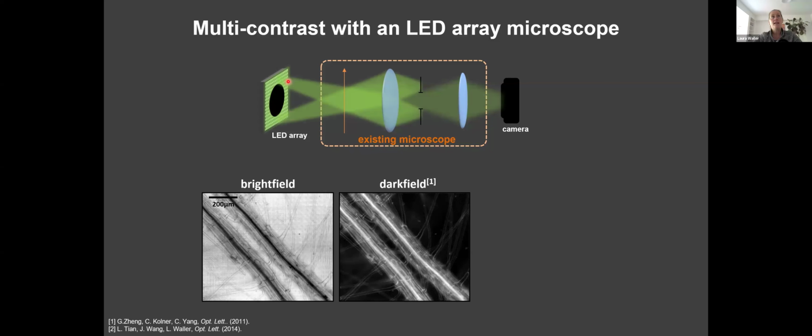If I illuminate the sample with LEDs outside of that, what I call the bright field circle, or the circle inscribed by the NA or numerical aperture of the objective, then I'm illuminating with angles that are not capable of passing through the objective. So I'll see a dark image unless the sample is scattering the light back into the aperture. When you see stuff light up in this image, it's stuff that's scattered to angles beyond the NA of the microscope. That's dark field imaging.